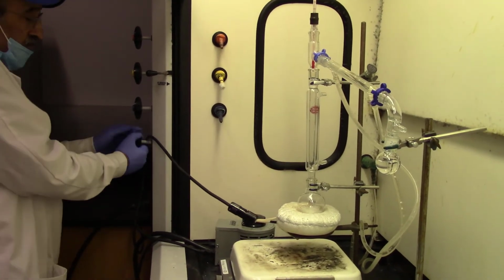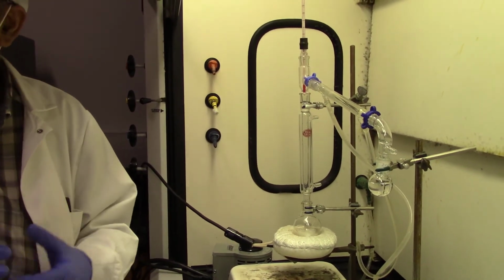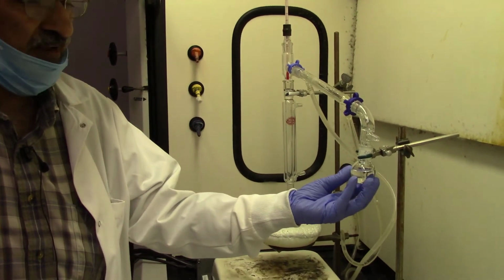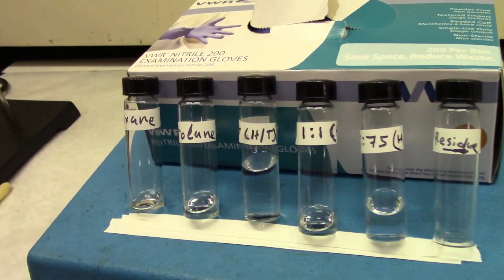So this is the second fraction. I have actually finished the experiment, so I'm going to basically turn the water off and turn the heat off, and remove this flask. So there are three fractions now: first fraction, second fraction, and third fraction in the pot.